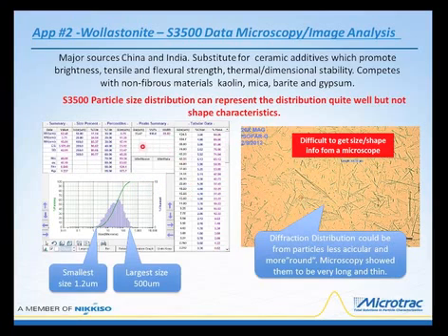I can't go through all this data here. If you're a Microtrac user, please visit one of our courses, or just call me or email me and I'll be glad to help explain the rest of this data. But let's go down to the graph here, and this is a percent passing and also percent channel data. Looking at the percent channel data, we get a particle size distribution. And we can see that the particles range from somewhere around a micron up to a few hundred microns.